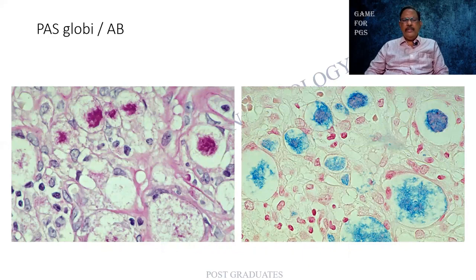Histioid means it resembles the histiocytes. There are other stains also which can be done. This is a PAS. It is not as convincing as the Fite-Faraco stain, but still it is positive. The bacillary details are not very well brought out, but the positivity is there in the PAS stain. Here again it is positive. Again the bacterial architecture is not well brought out.